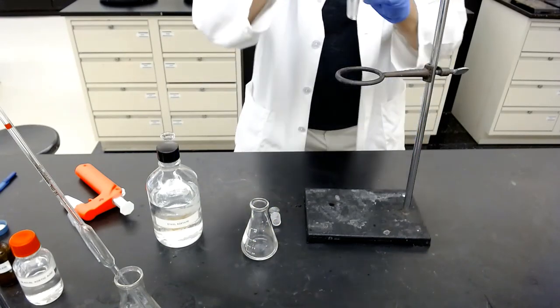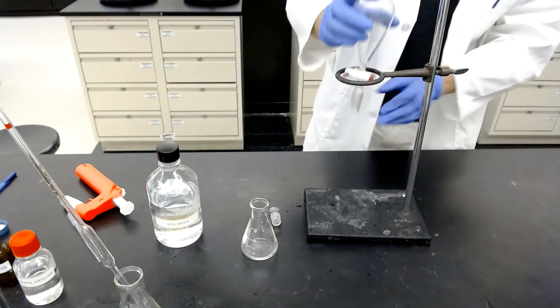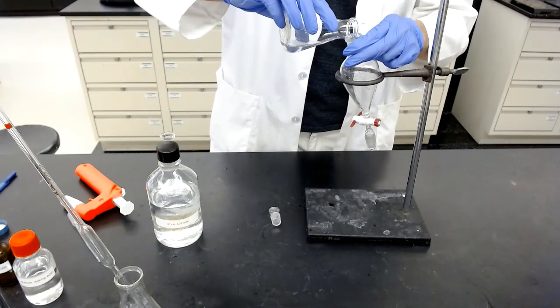What happened to the top organic layer? Yeah, you know what? We dump it out to a waste container. And then we pour our aqueous layer back to the separatory funnel.